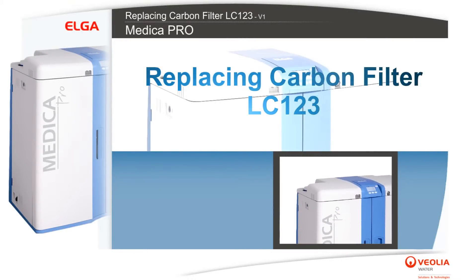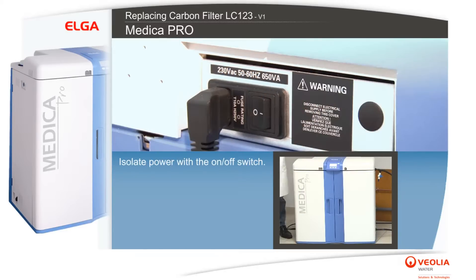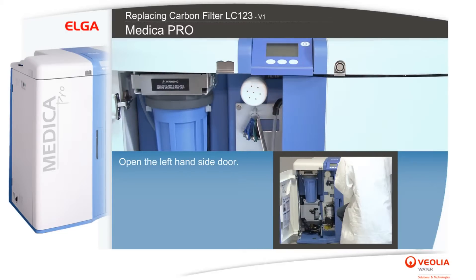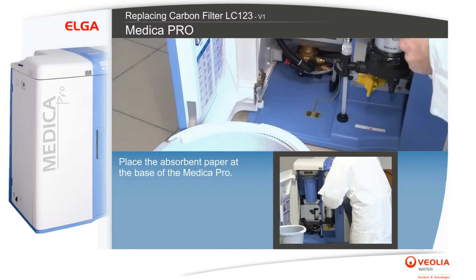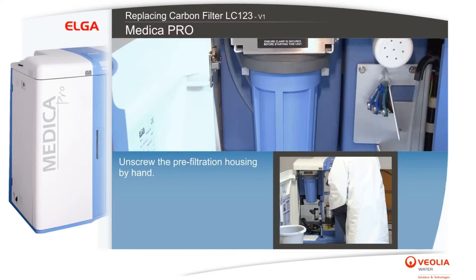To replace the carbon filter LC123, isolate power with the on-off switch and open the left-hand side door. Take a bucket or a bowl as well as some absorbent paper, and place the absorbent paper at the base of the Medica Pro.